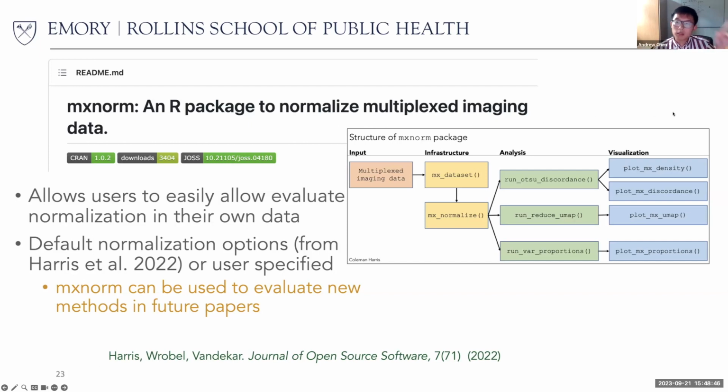I'm a little curious. Are these images acquired at a single depth, or are they multiple images across depths that are aggregated together to be one 2D image? Different depths, you mean, so they're not 3D, if that's what you're asking. You just take one tissue slice and treat it as 2D. Is that what you mean? Oh yeah, I was just curious because a lot of microscopy will involve different depths of imaging, and then they collapse it together.